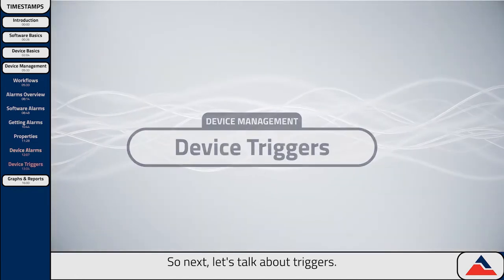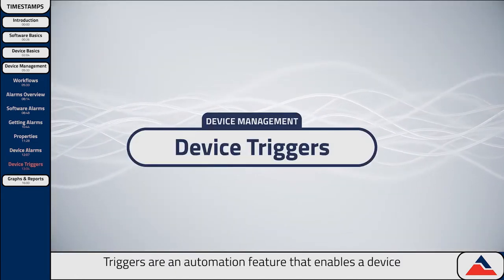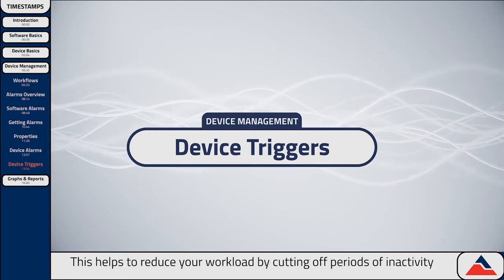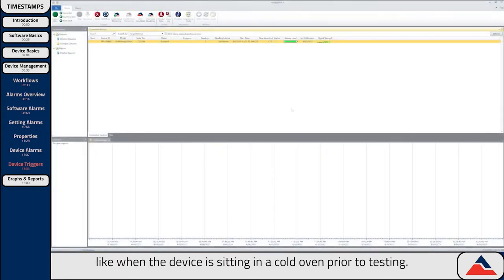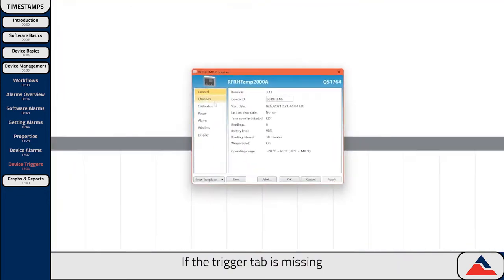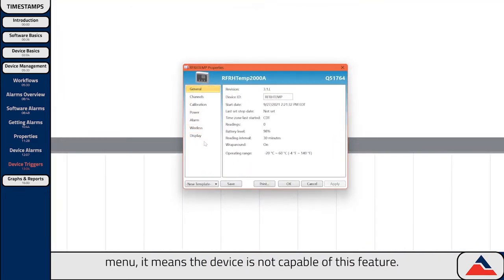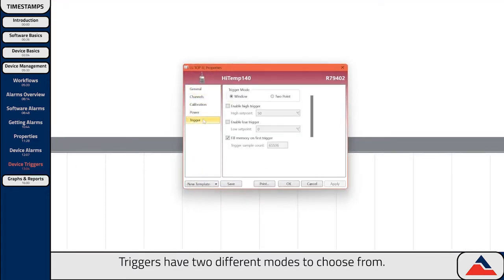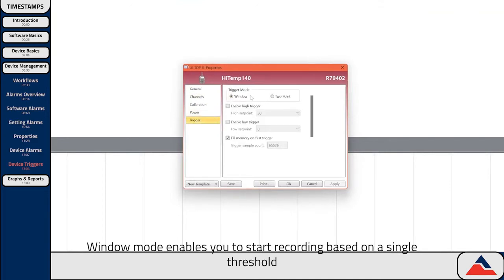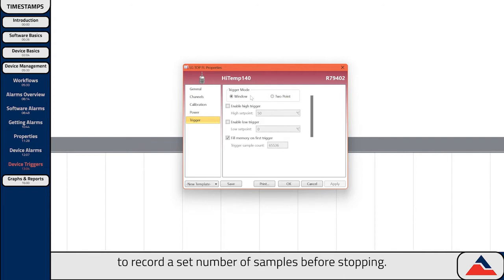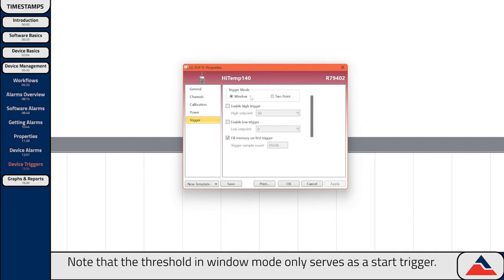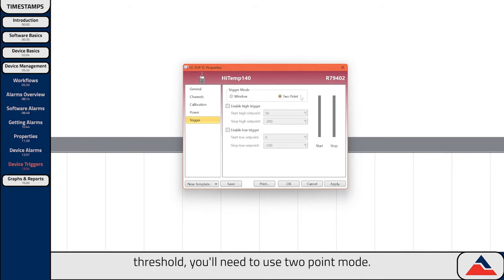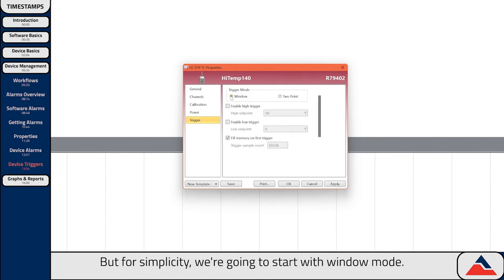Next let's talk about triggers. Triggers are an automation feature that enables a device to automatically start and stop recording based on predetermined thresholds. This helps to reduce your workload by cutting off periods of inactivity, like when the device is sitting in a cold oven prior to testing. If the trigger tab is missing from the properties menu, it means the device is not capable of this feature. To begin, select the trigger tab under properties. Triggers have two different modes: Window mode enables you to start recording based on a single threshold and gives you the option to record a set number of samples before stopping. Note that the threshold in window mode only serves as a start trigger. If you'd like to set both a start and a stop threshold, you'll need to use two-point mode.